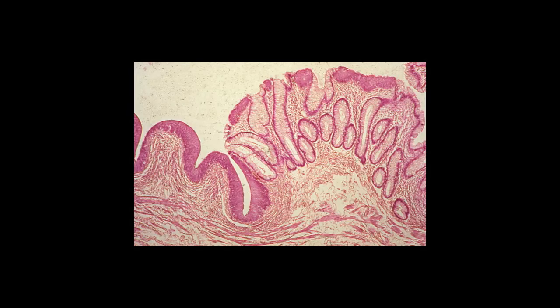I'd like you to think about some transitions here. Imagine you were endoscoping a patient and moving from the outside into the colon. You would see stratified squamous with keratin on the outside, then the anal canal, which would just be a stratified squamous, which you see here on the left of the slide, and then you get an abrupt change to the simple columnar epithelium that you'd find within the colon. So I'd like you to keep that orientation in your mind as you think about the arrangement at this portion of the large intestine.